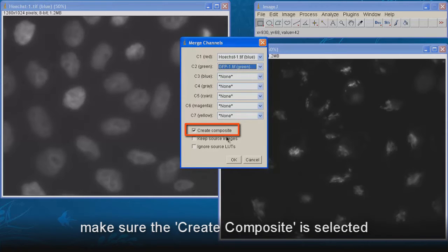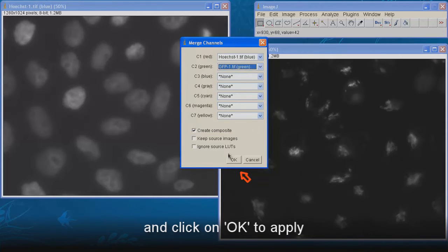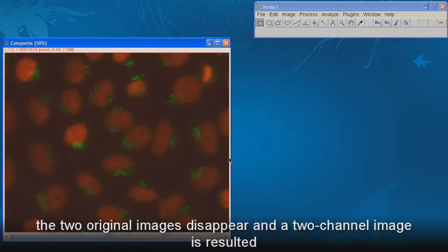Select other channels as none. Make sure the Create Composite is selected. And click on OK to apply. The two original images disappear, and a two channel image is resulted.